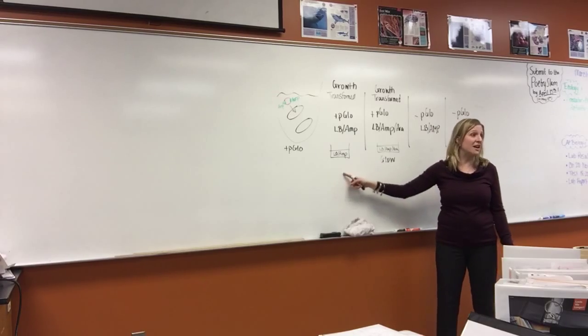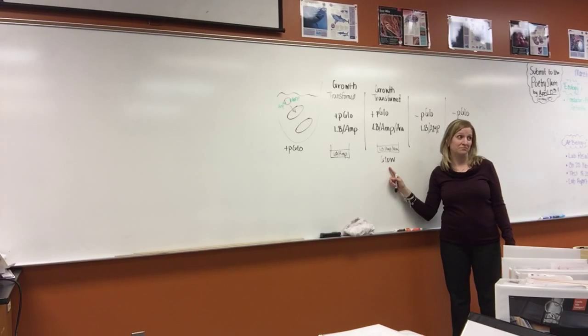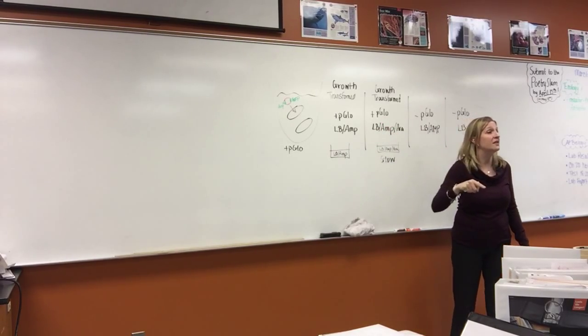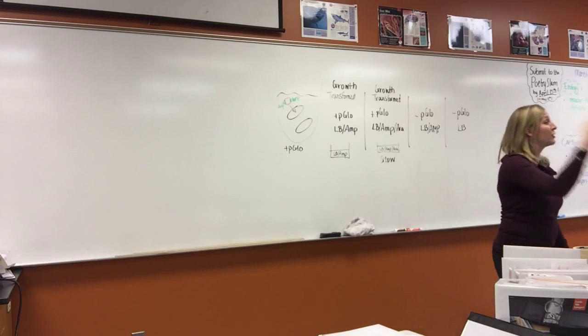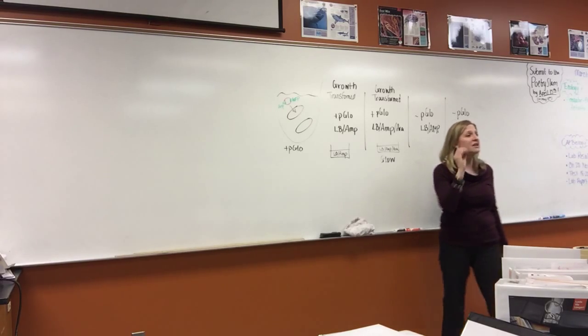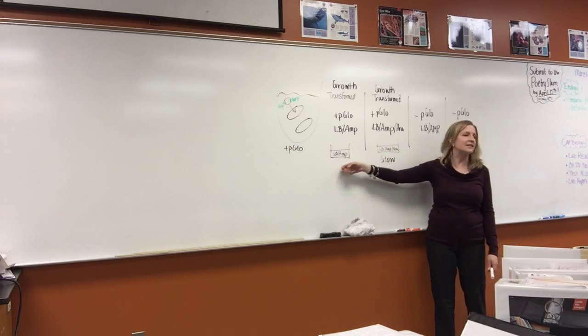So it's not the gene. So this one is doing what with the gene? It's going through protein synthesis, and it's a green fluorescent protein gene, which codes for making a green fluorescent protein, all right? That fluoresces green. So it's actually the protein that's causing this to happen. That's why this one isn't glowing.